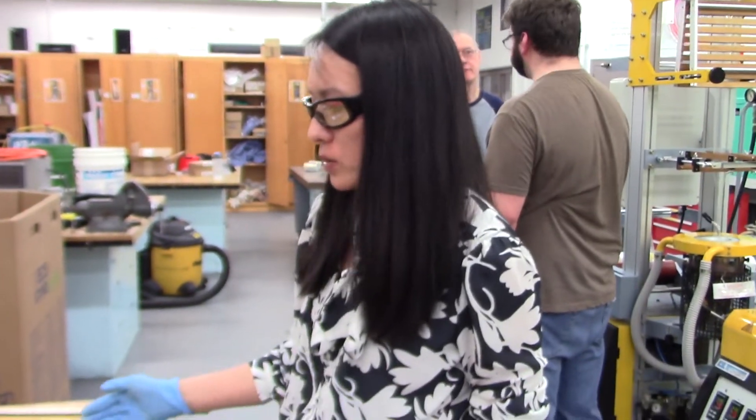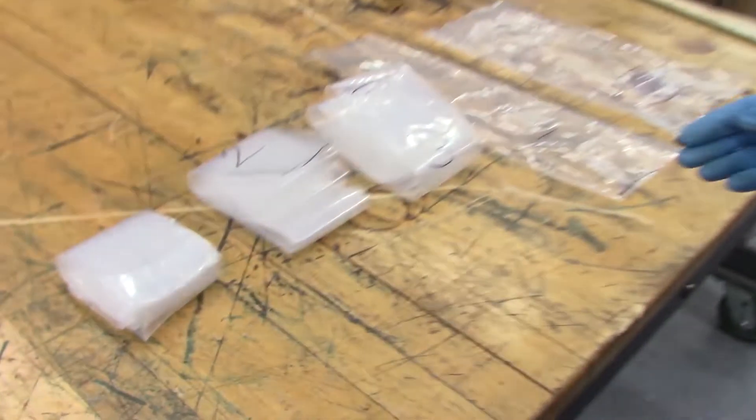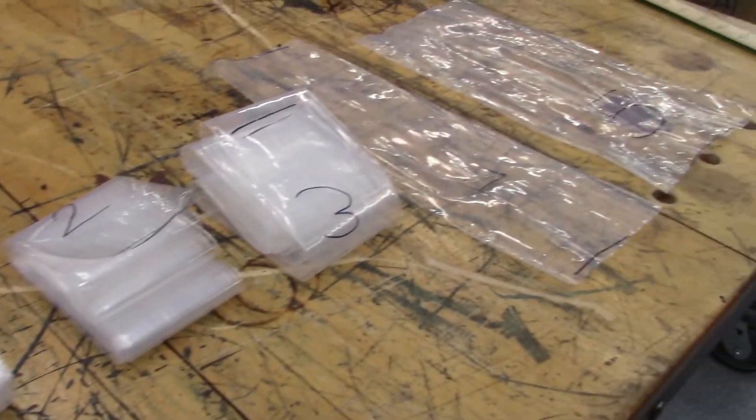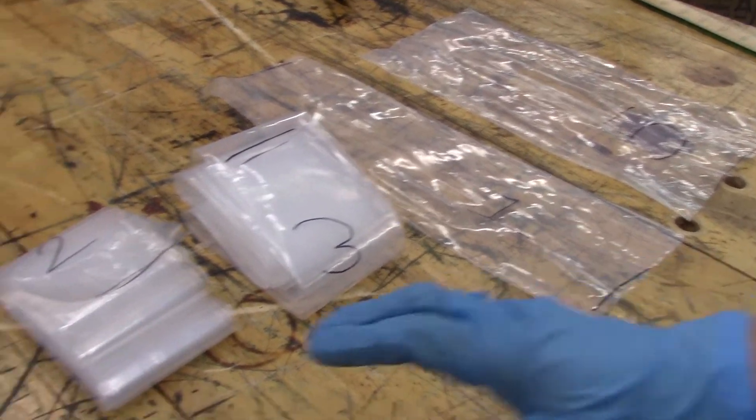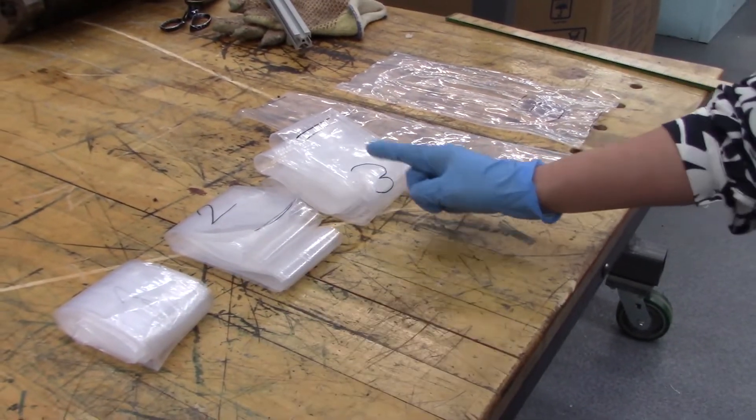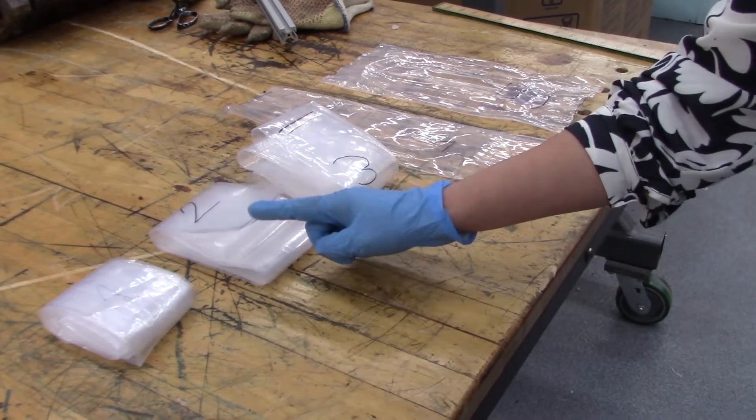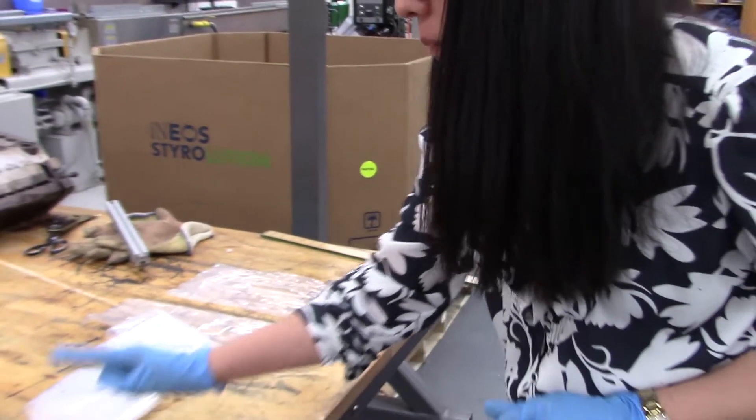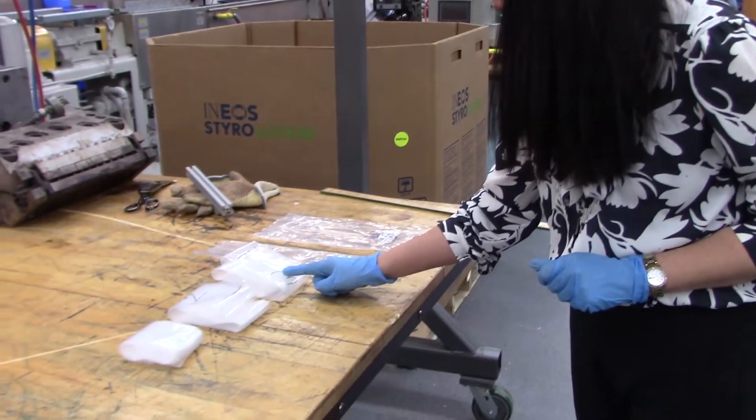This is the blown film sample we just produced during the film blowing process and now we are going to measure the weight of these three samples which we collected at 30 RPM, 45, and 60 RPM.